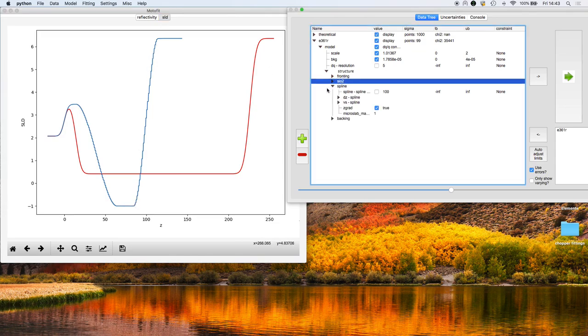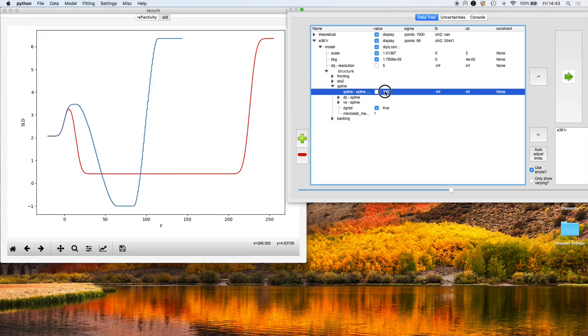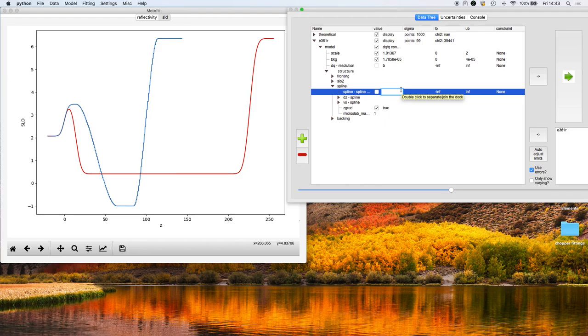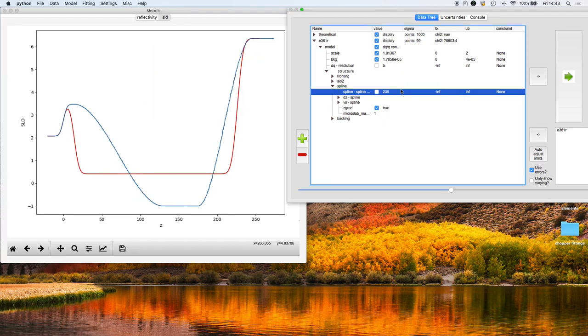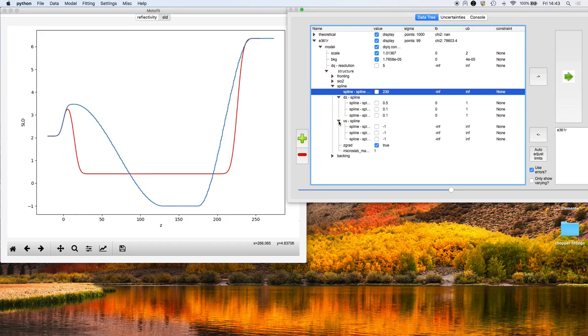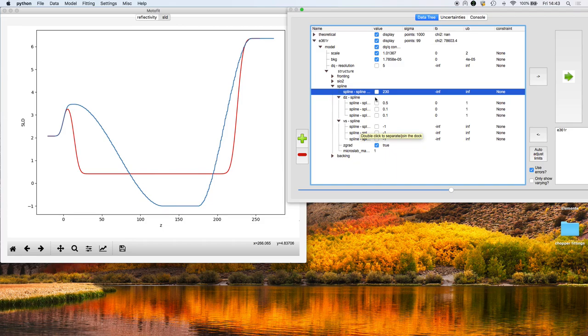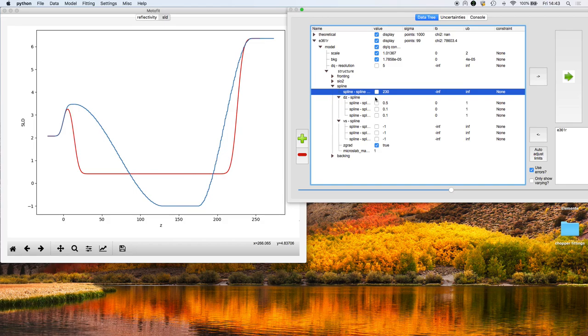I'm going to increase the full extent of the spline to 230 angstroms and expand these two nodes. What a spline is, is a way of describing a region of the scattering length density profile by a polynomial with a set number of nodes. The spline draws a smooth curve through those three points. It's a free-form way of describing a region of the scattering length density profile.